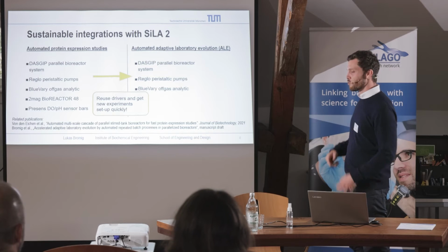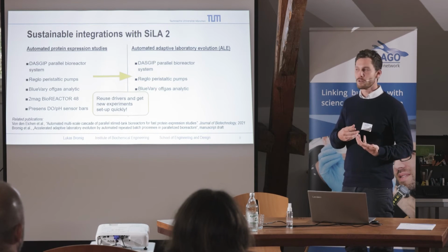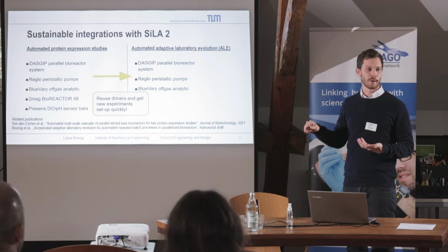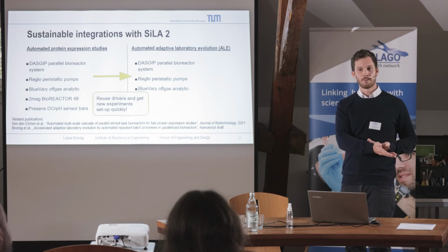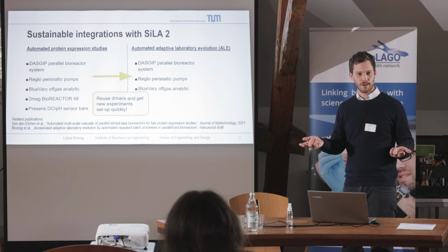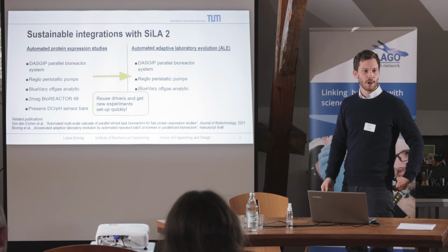And right now, it's not just my laboratory at my university, at my chair, that is using those drivers, but some of my colleagues are starting to use them as well, because they, by chance, have the same peristaltic pump as I do. They have the same BlueVary off-gas analysis. And now they don't have to do their own integrations anymore, because they can just rely on the drivers that I wrote, which saves a lot of time.